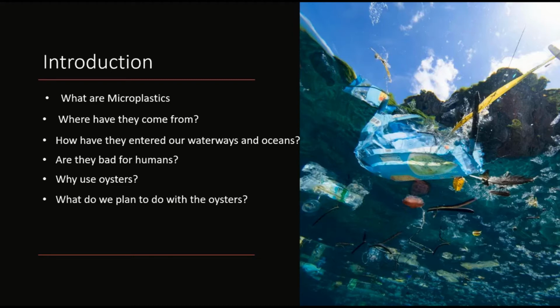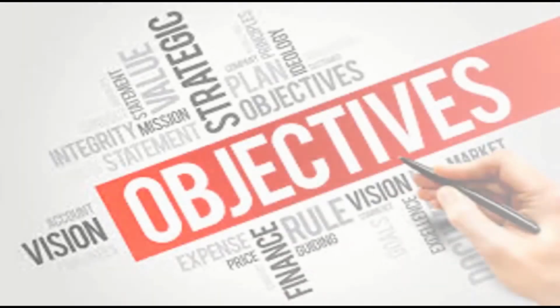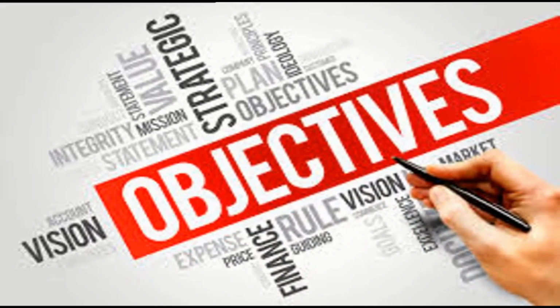Oysters are very easy to catch. In our case, as they were on the roots of mangroves, we simply just had to break one root and peel off the oysters from it and place them into a bucket. Oysters are bioindicators. That is, they are species that are used in the biomonitoring of the environment. In order to evaluate how contamination exists spatially, sessile species are the best. Since oysters can be easily tested, we will test 3 digestion methods, which we'll talk about later, against these oysters.